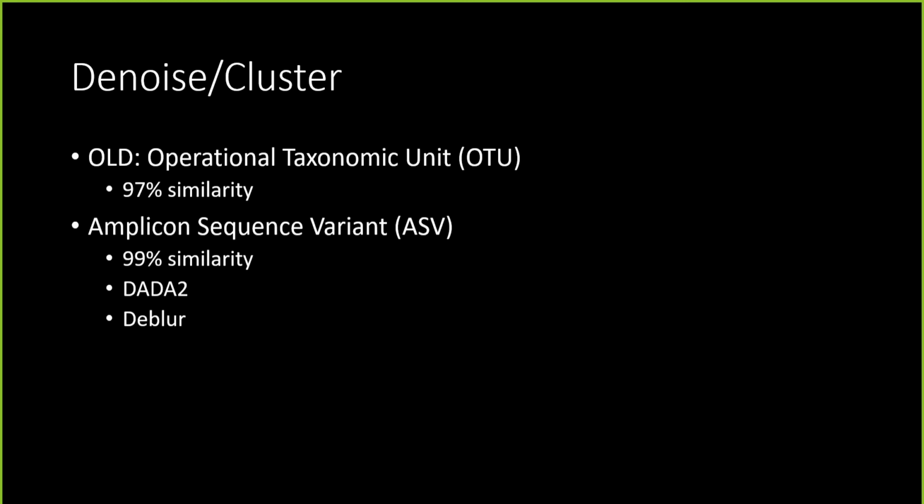For instance, basically what you'd say is, all of these bacteria that have this genera have the same function. On the other hand, that may be different in some environment. And so this is where ASV comes in, especially in an environment where there's very, very low biodiversity. But then again, it's all about function sometimes. And you can still do the functional analysis of ASV.